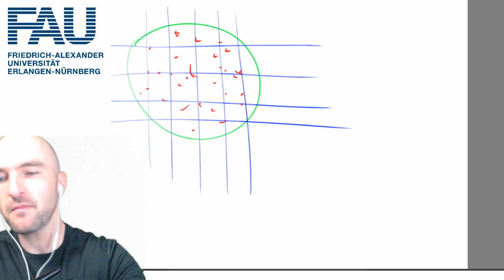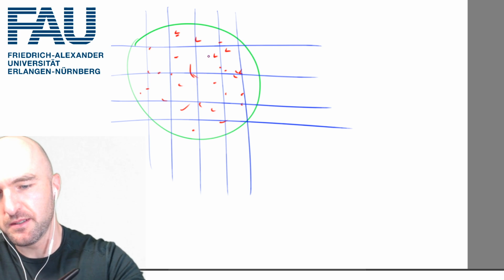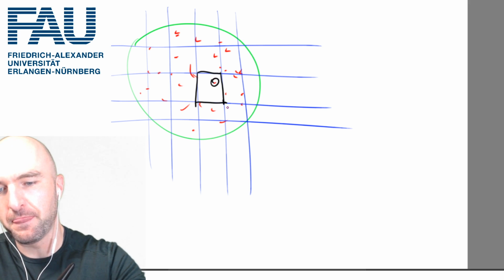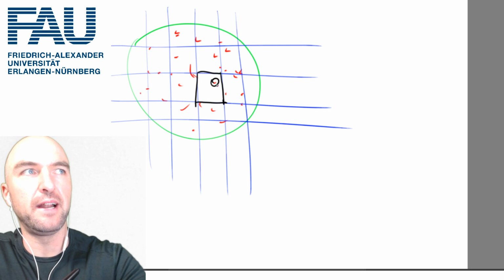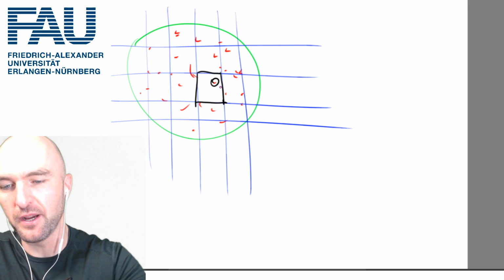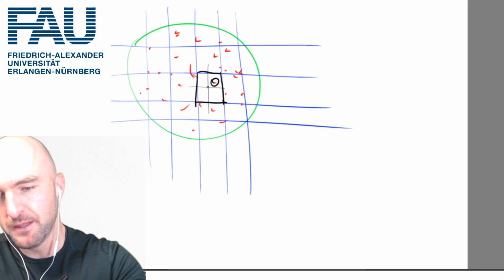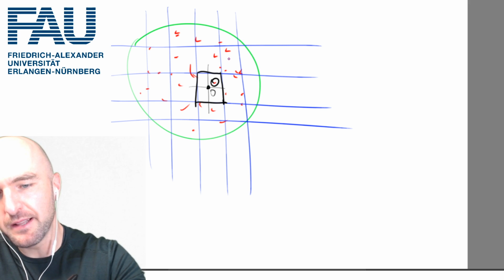And right now what we're saying is if it's for this bin, then we're saying this thing here is in this bin, and it's only in this bin. And what Andy is talking about in delocalization, you will find that function implemented for example in IVAS as well, is that, well, this bin essentially has a coordinate system around here, and this might be the coordinate origin. So this is our origin. So this thing here does actually belong to a certain extent to this bin and to this bin, yeah?